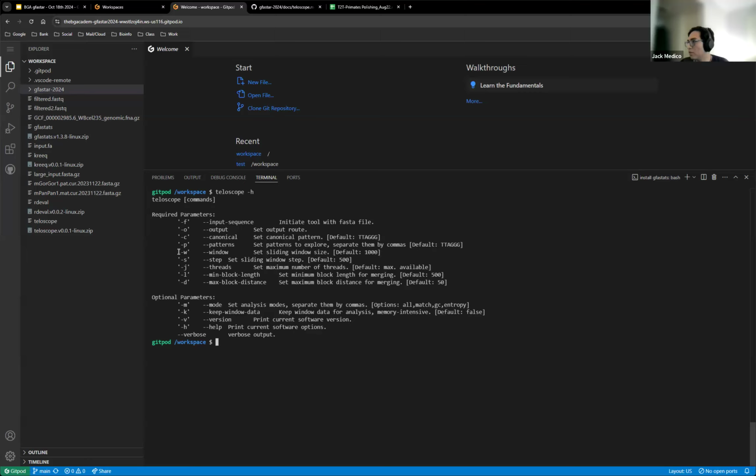Okay, so W is the window, just to establish the window size. Because we are measuring GC entropy, the longer the window, the smaller the number of windows you will get. So there's a trade-off. If you're interested in exploring particular changes in windows, maybe that's for you. If you don't want it, that's also okay. You can just use the default.